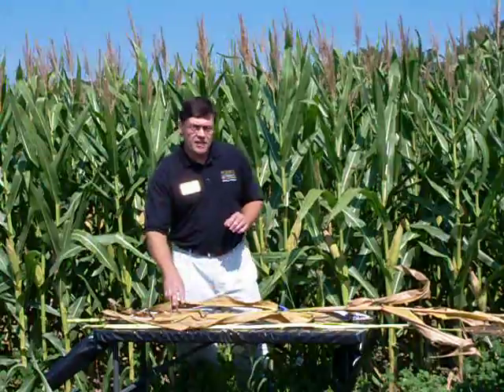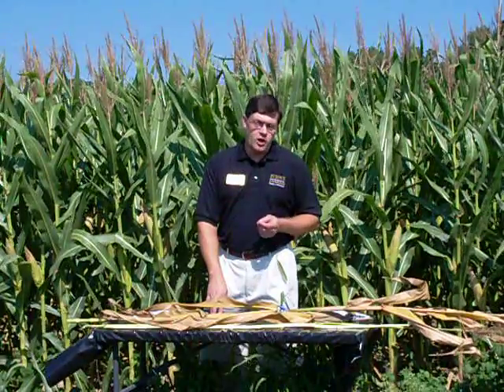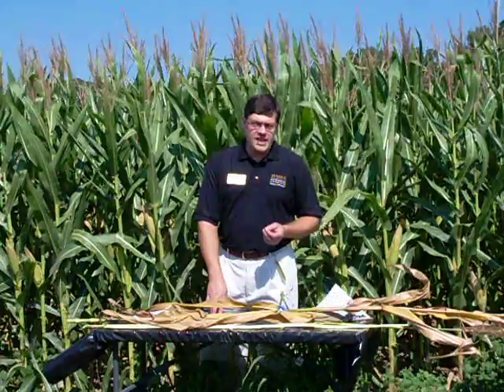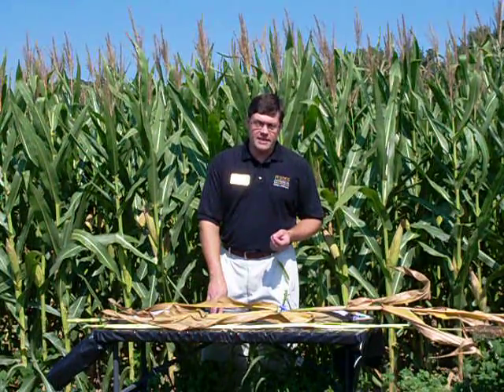To do the testing in a field, there are two different tests we can utilize to identify nitrates in standing corn. The first is called a quick test, which I'll be demonstrating today, in which sulfuric acid is used to get a very quick qualitative analysis of what's in the cornfield. By qualitative, we mean we simply identify whether or not nitrates are in the corn and at a level that may dictate further testing being needed.